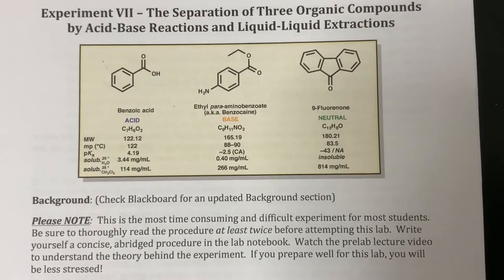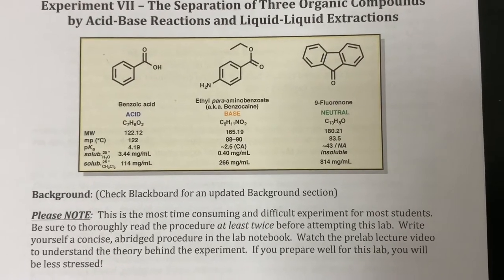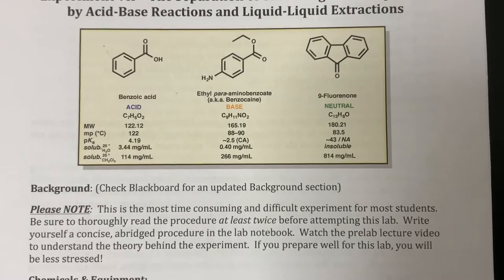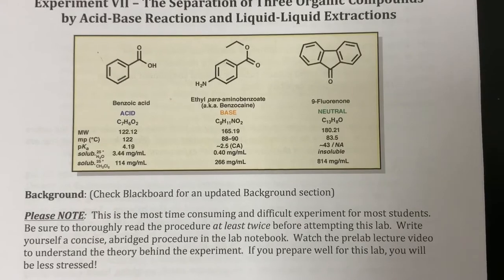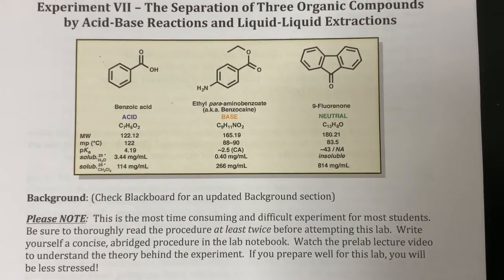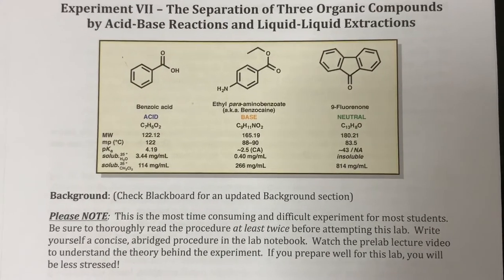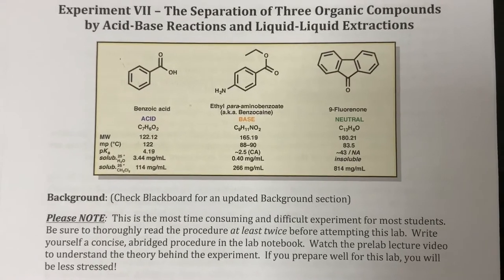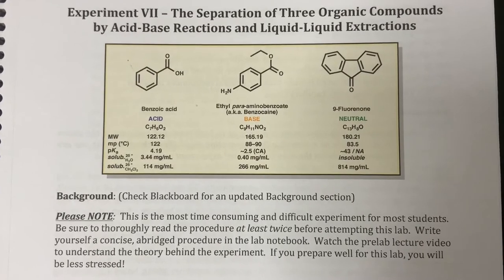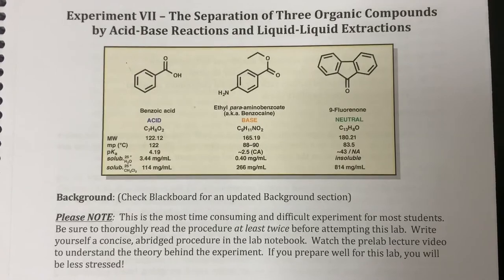Then eventually we are going to add base to the organic layer, having 2 phases of course. Benzoic acid will be deprotonated as its benzoate salt, and then that conjugate base will be more water soluble. And so then we can extract it away from the organic layer, and the organic layer will always contain the 9-fluorenone, which is much more soluble in a lipophilic, aka hydrophobic, environment. The 9-fluorenone will not dissolve in the aqueous layer, regardless of its pH.